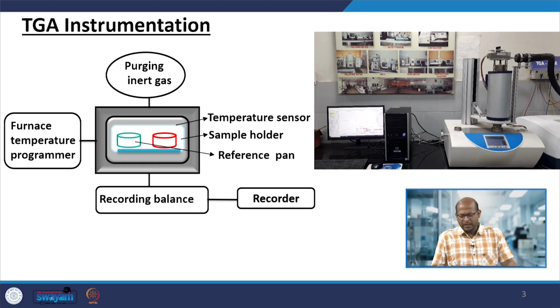find that out. So, using these TGA methods, when we prepare any coke deposition, suppose carbon deposition or CNT deposition on a particular catalyst surface, or nanomaterials that we have prepared for specific applications, particularly multi-wall carbon nanotubes, fullerenes or single-wall ones, whatever materials we have prepared, the nanomaterial is deposited over the surface of the catalyst.